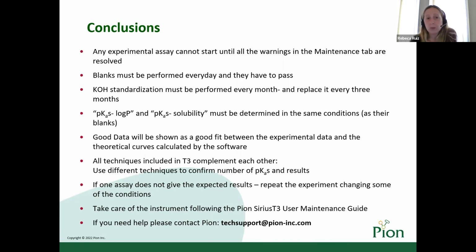Good data will be shown as a good fit between the experimental data and the theoretical curves calculated by the software. All techniques included in T3 complement each other, so please use different techniques to confirm the number of pKa's and results. If one assay does not give the expected results, please repeat the experiment, changing some of the conditions. So don't repeat the same experiment with exactly the same conditions.